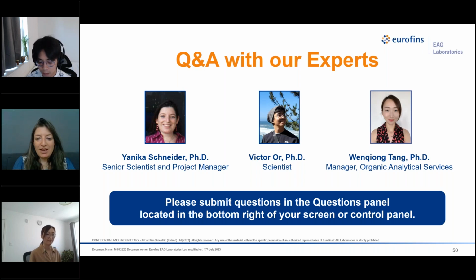Thank you. It's a great answer. I have a question here, whether we can use these techniques for deformulation, and I'd like to answer that one. Absolutely. These are great techniques, especially if you don't know what something is. This combined with an elemental technique is one of the best tools for figuring out what it's made out of. Because with FTIR, with Raman, we have these libraries. We can characterize unknown materials. So it's the same principle as what is the defect? It's just, what is the material made out of?